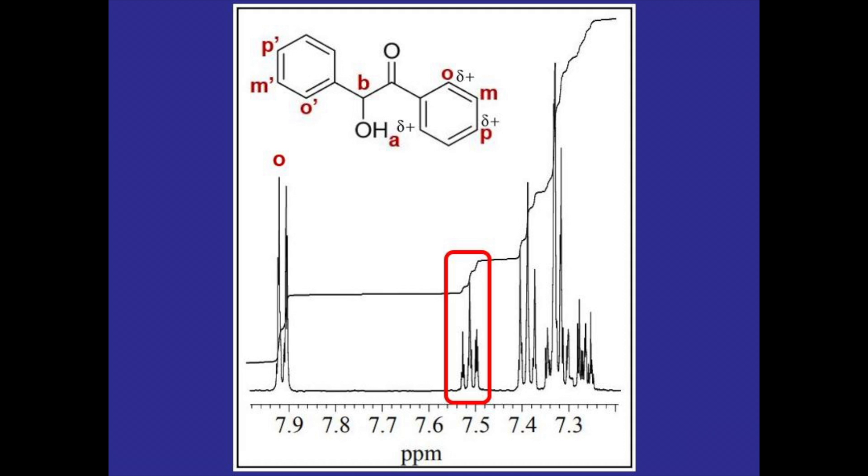Now from here we could probably pretty easily move on to the next peak and analyze that one. It's a clear triplet with an integration that looks to be about half the size of the integration for hydrogen O so it would be an integration of one.